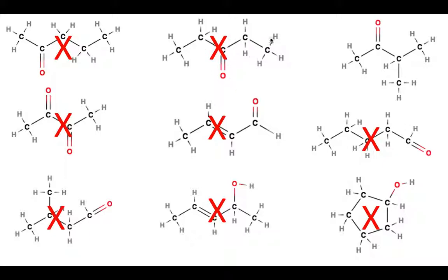It can't be these over here, because in this molecule, there is tons of symmetry in 3-pentanone. These hydrogens here are exactly the same as these. It's a hydrogen on a carbon, 2 carbons away from the carbonyl group. A hydrogen on a carbon, 2 carbons away from a carbonyl group. Even though they're on opposite ends of the molecule, these are exactly the same. They're completely symmetrical. And these are completely symmetrical too, right? These hydrogens on a carbon directly next to the carbonyl carbon, hydrogen on a carbon directly next to the carbonyl carbon, there'd be lots of symmetry. We'd only see 2 signals, and we don't.